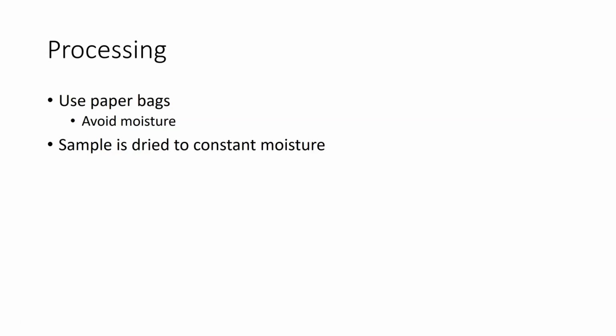When we know that we don't have moisture in it, then we are able to say that of the dry matter, this is the material that you've got on the inside. When we dried it, normally we do 80 degrees centigrade for about 24 to 48 hours. You do these in paper bags. One thing, we used to have a forced air oven where we did it.